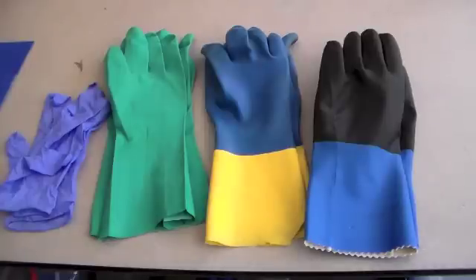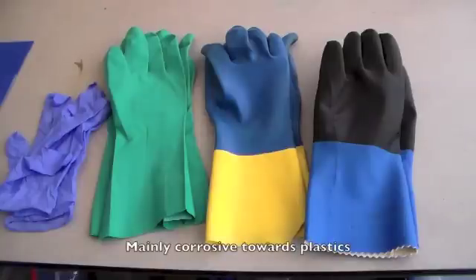Next are butyl gloves. These can resist all acids and bases, alcohols, ethers, esters, and ketones. Ketones are extremely corrosive — like acetone and methyl ethyl ketone — so you'll definitely want to wear the right glove with those.